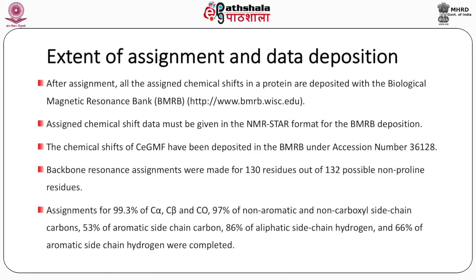Assignments for 99.3% of C alpha, C beta and carbonyls, 97% of non-aromatic and non-carboxyl side chain carbons, 53% of aromatic side chain carbons, 86% of aliphatic side chain hydrogens and 66% of aromatic side chain hydrogens were completed.